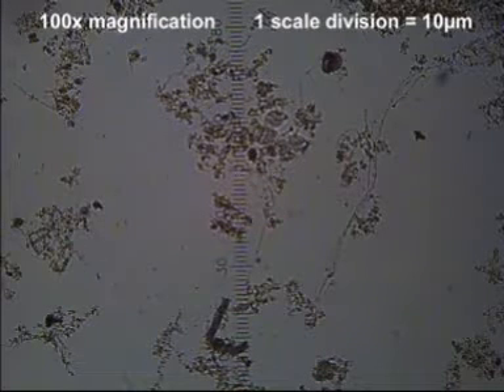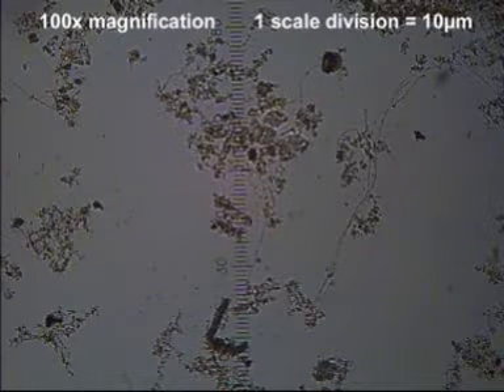We're looking at a colony of Zeuthamnium, a colonial stalk ciliate protozoa, in this case found in the activated sludge biomass of an extended aeration wastewater treatment plant.